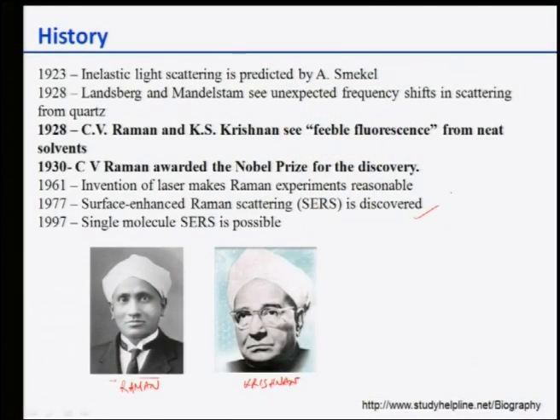In 1997, another big change happened in Raman spectroscopy, when a single molecule showed surface enhanced Raman spectrum or scattering. So, therefore, nowadays we can actually go all the way to the single molecule, get Raman scattering, and then probe it using the Raman spectroscopic technique. So, that is how it is actually possible.